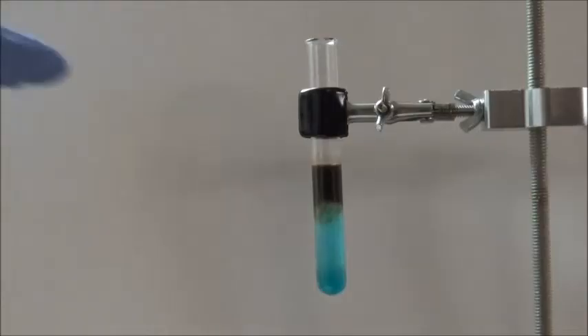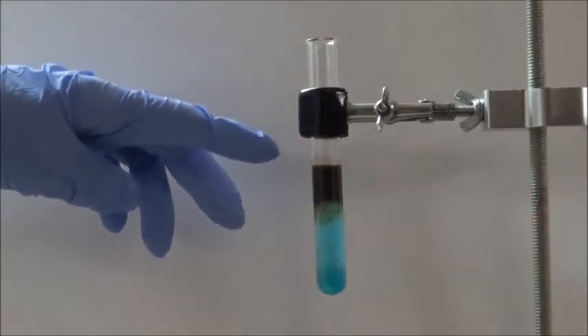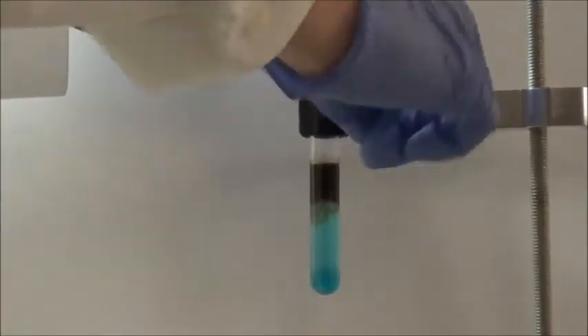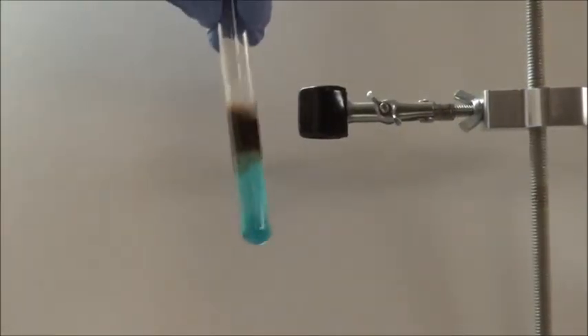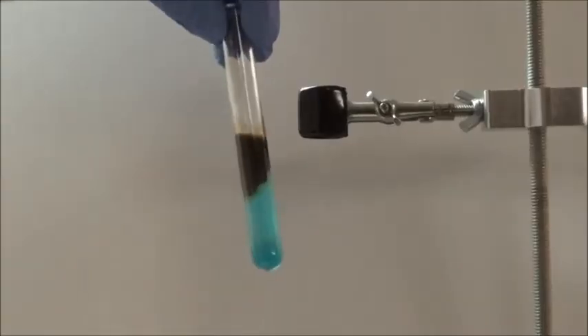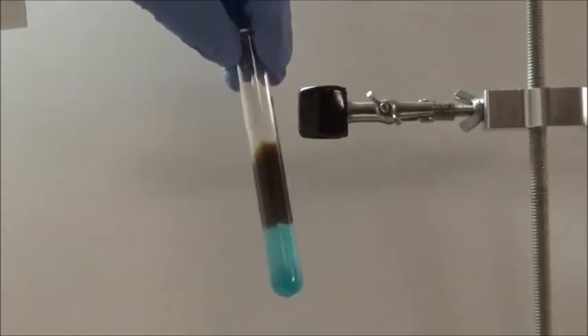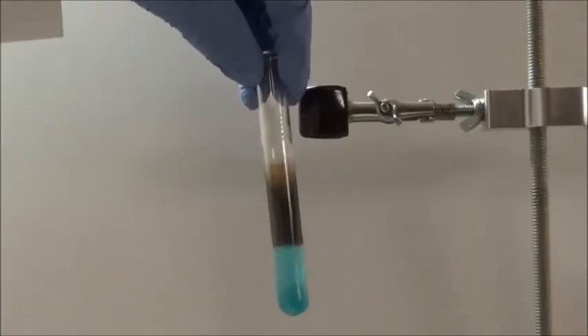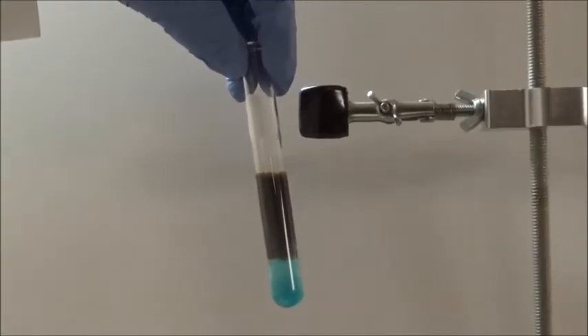Right now, the copper sulfide is concentrated near the top. I will now swirl the test tube to move the sodium sulfide lower down. As it moves down, more copper sulfide is precipitated.